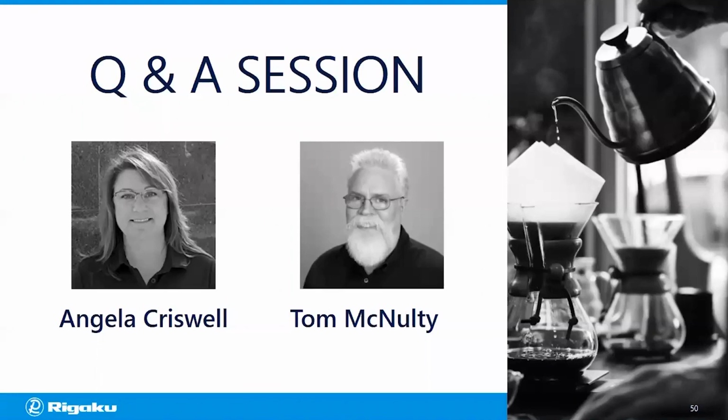Jerome asks that he wants to make sure that you were using Dragonfly for data processing, which I'm guessing you were. Absolutely. He's asking, how does this work for plant images? What software do you recommend for plants, if not Dragonfly? I use Dragonfly exclusively to look at each of these. It was quite powerful.